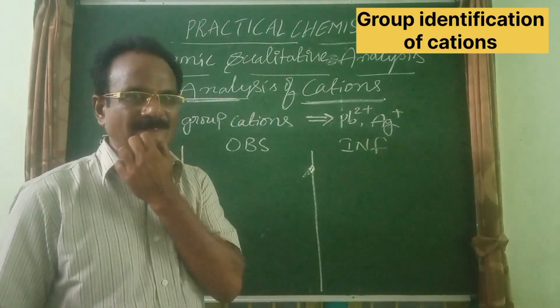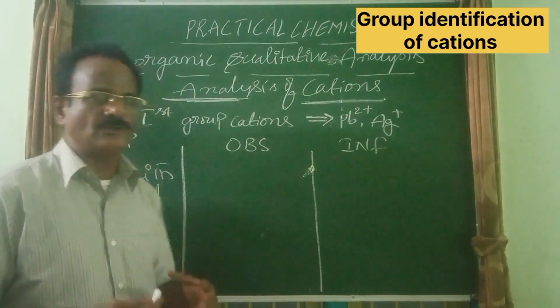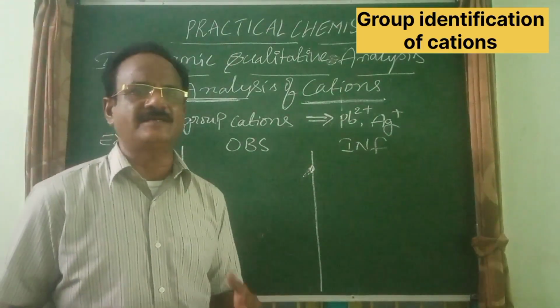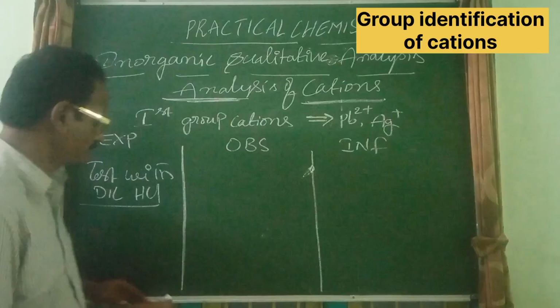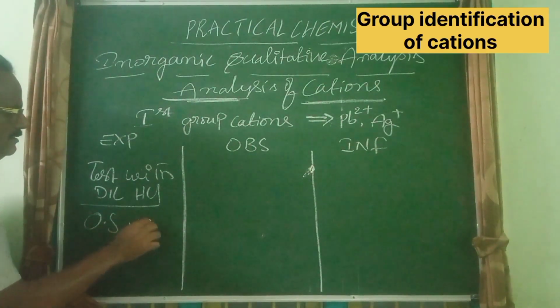Test with dilute HCl. Here the original solution of the given salt is to be added with dilute HCl. Here I am writing OS for original solution.